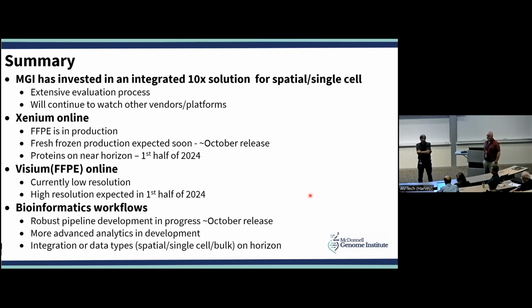If you know what you're looking for, yes, because there your chances of picking it up are much better. And 10x tailors the probe sets based on the gene expression also, so as to not swamp out some of the lowly expressed transcripts.